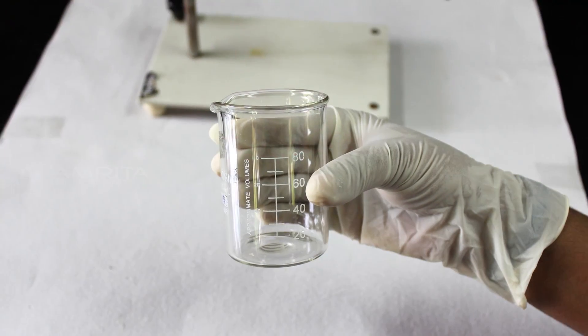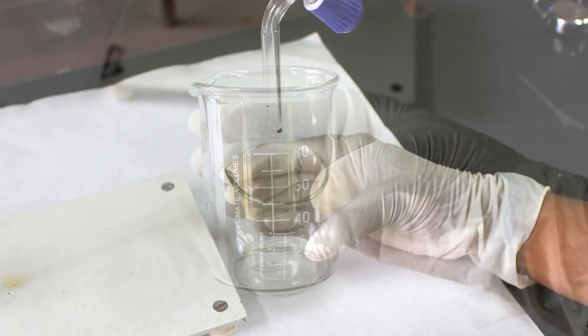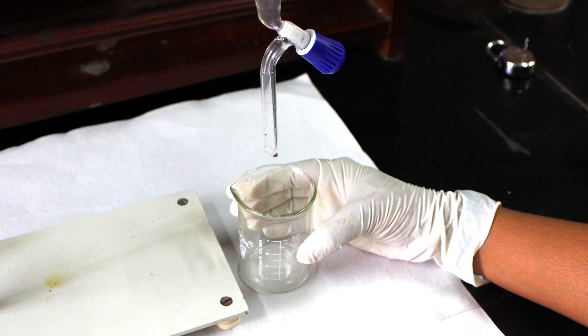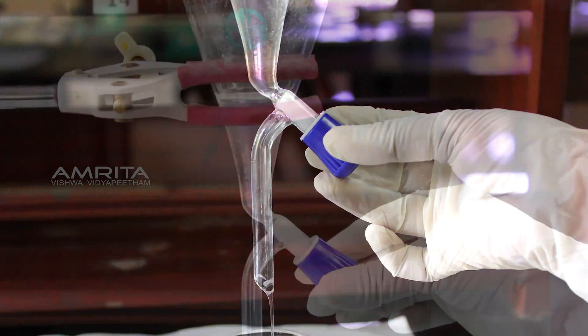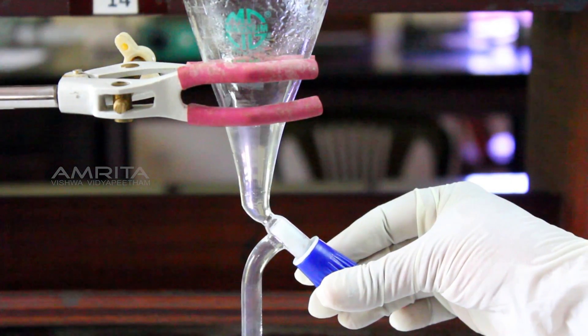Take another beaker and place it below the separating funnel. Open the stop cock and now collect oil from the separating funnel.